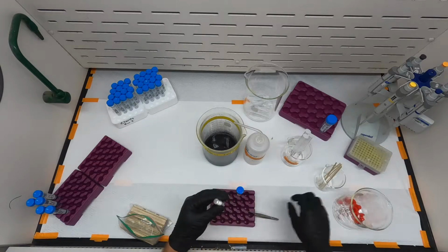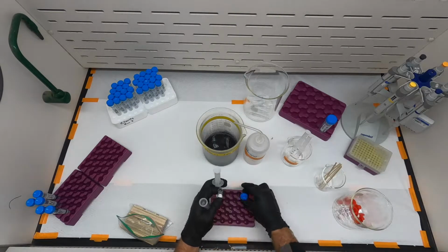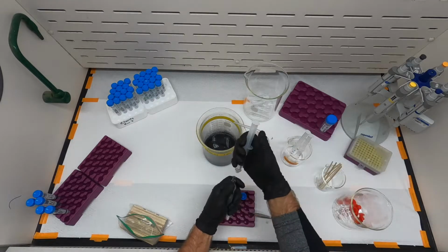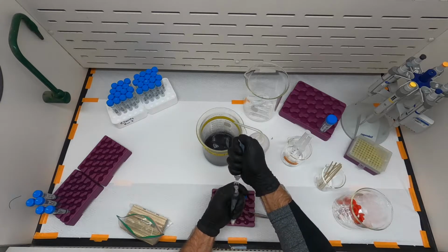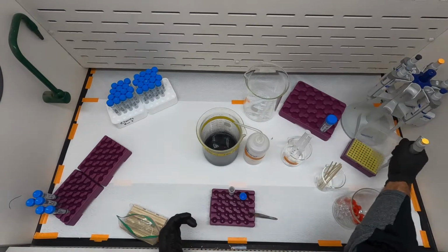For each sampler, we push the filter material out of the glass housing with a wooden dowel rod and suspend it in methanol. We then add an internal dicamba standard. We then take all the samplers to a separate facility for quantification using LC-MS.